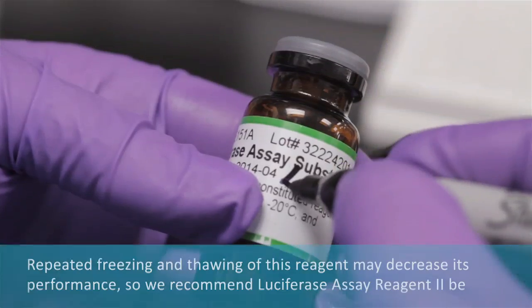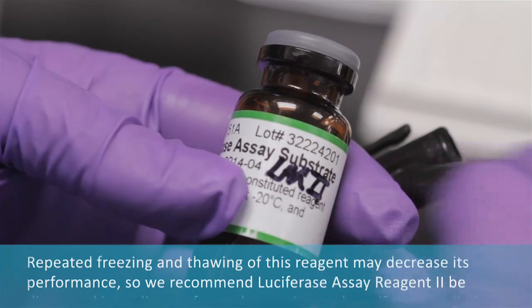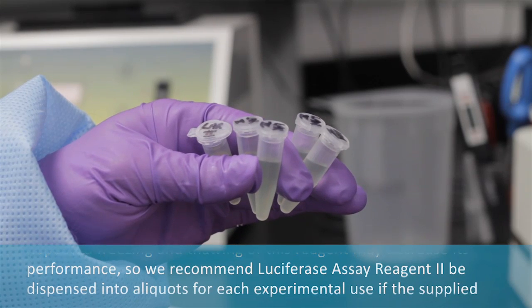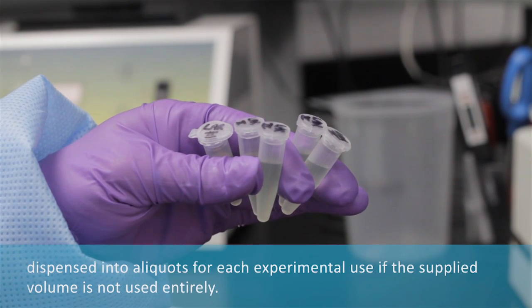Repeated freezing and thawing of this reagent may decrease its performance, so we recommend luciferase assay reagent 2 be dispensed into aliquots for each experimental use if the supplied volume is not used entirely.